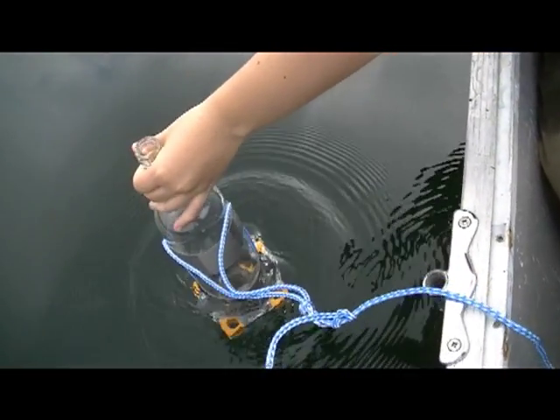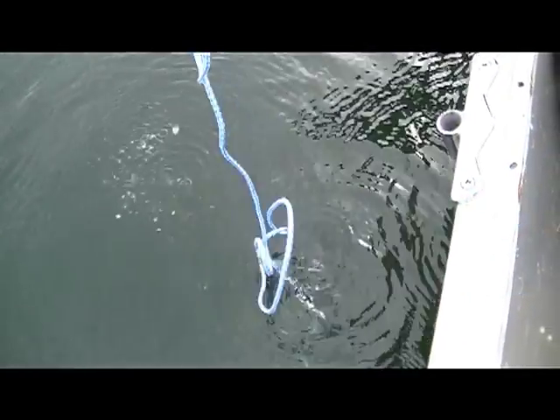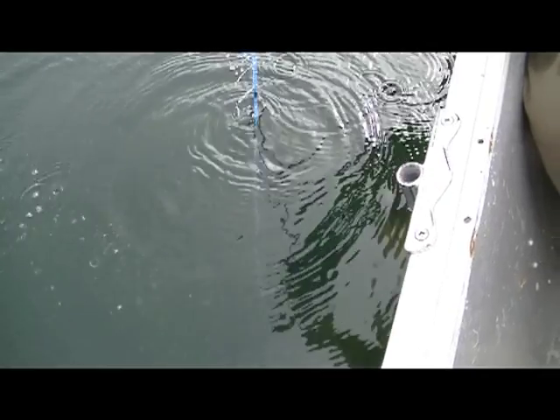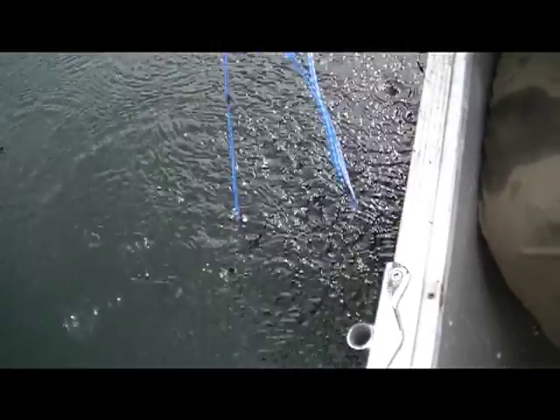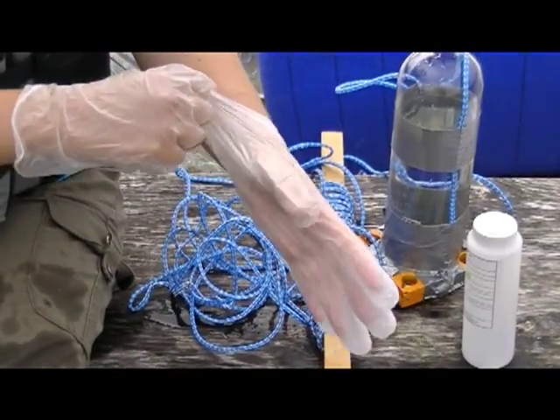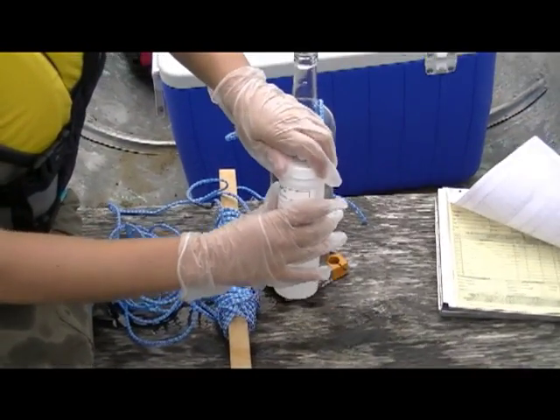Allow the sample bottle to be lowered as quickly as possible into the measured sampling depth and then raised to the surface. If the bottle is not filled, or if it is overflowing before coming back to the surface, empty the bottle and repeat. Adjust your speed or rate of retrieval such that the bottle just fills as it reaches the surface. It's at this stage that you should pull on your vinyl or latex gloves, especially before manipulating your laboratory bottles.